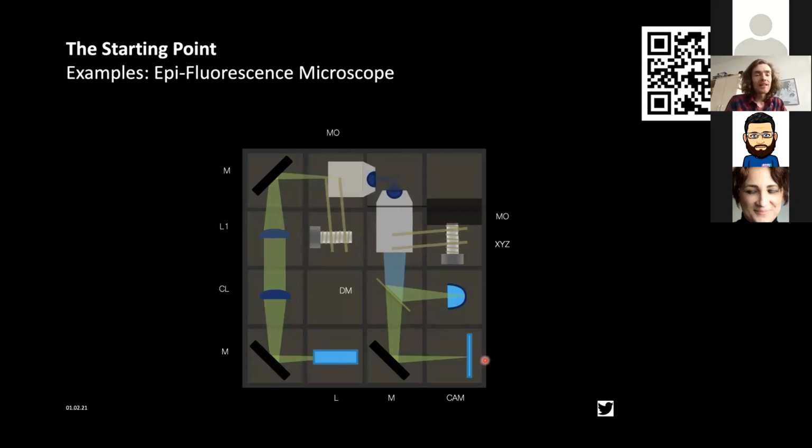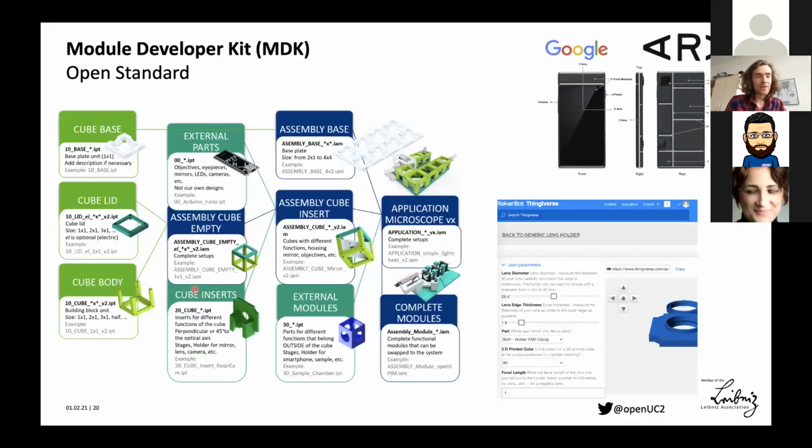Yeah, and so as I said, we have a library with already existing parts. This is kind of an old thing right now, so that was version 2, which you can also find in the manuscript we recently published. And it's thought the way that the cube itself is always the same, just the stuff which goes in there, with always a standardized insert, for example, which holds a lens or an LED or whatever. This one can be adapted in order to make a functional cube. And many functional cubes can, for example, lead to a setup. And it's very nice, well, very simple to put together. In this case here, it was magnetically, with some ball magnets and some screws.